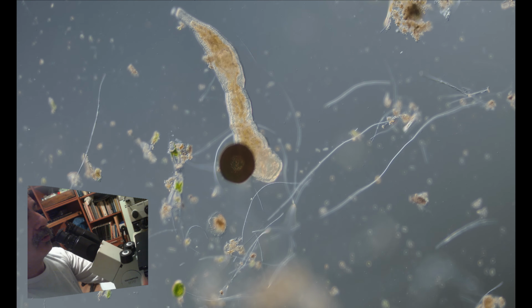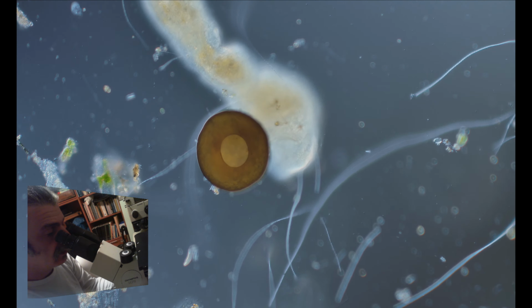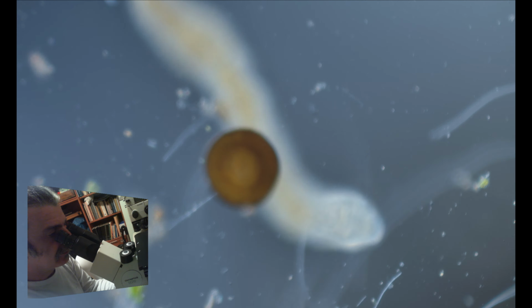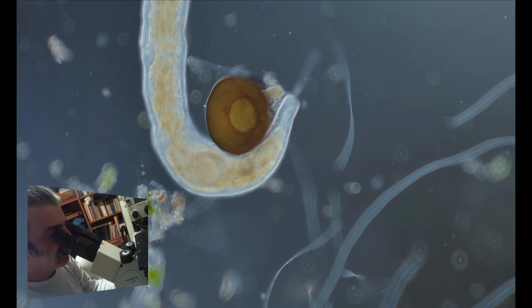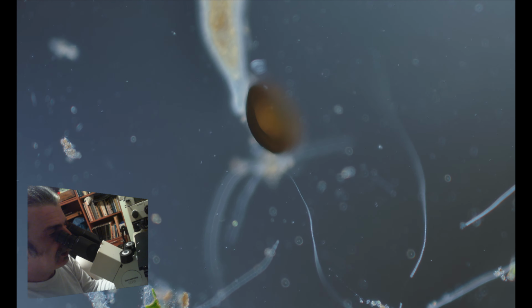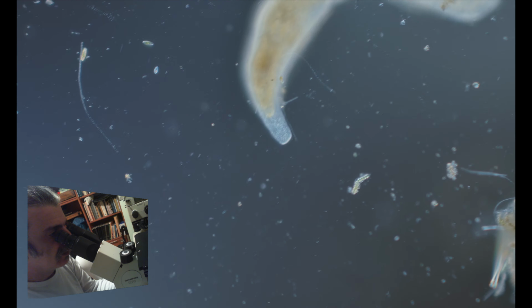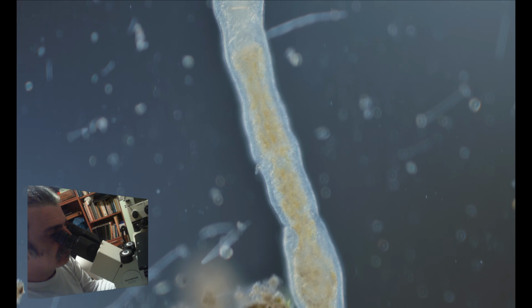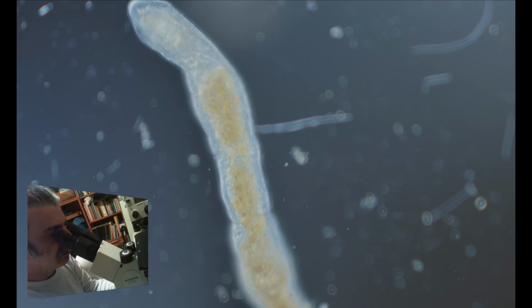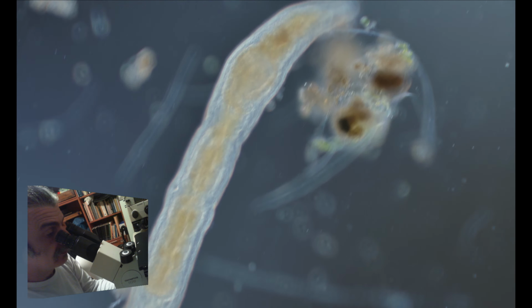Okay, let's take a look at this nice worm. Going back to 20x, we can estimate this worm to be around 1 millimeter, and it's surrounding another amoeba called Arcella, which has a test, a protective home if you like. You can see the inner gastro tract of this nice worm.